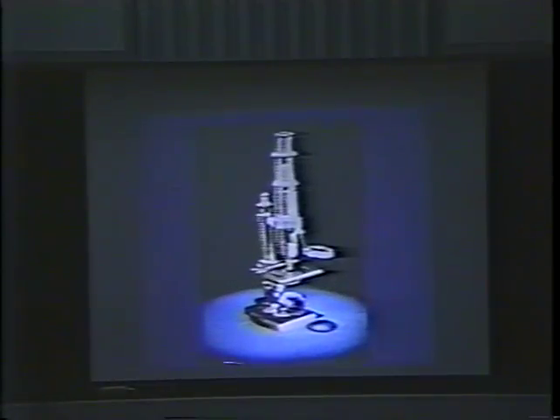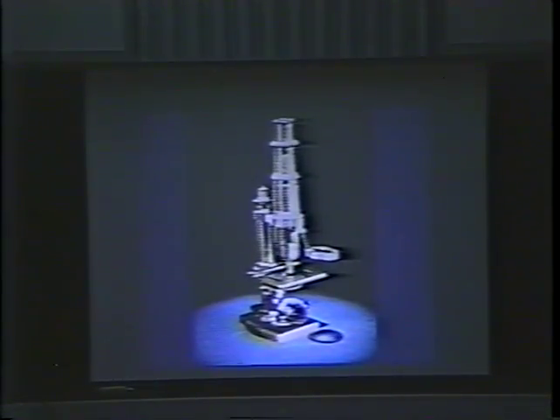Cells are the basic units of living organisms. Their study has been crucial to the understanding of plant, animal, and human biology. Since the 17th century, the microscope has been the major tool for cell research. The development of synthetic dyes for staining cells in the mid-19th century and of newer and more powerful optical systems greatly enhanced the process. What the cell sorter adds is the ability to separate large numbers of functionally different, although closely related cells from an organ, and to keep them alive so their functions can be studied under controlled conditions.